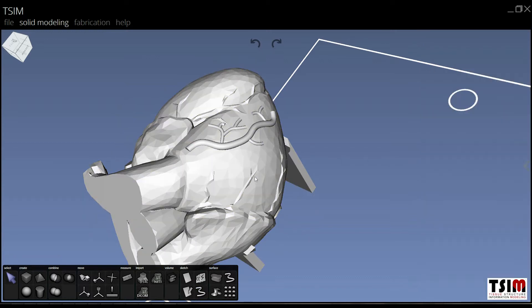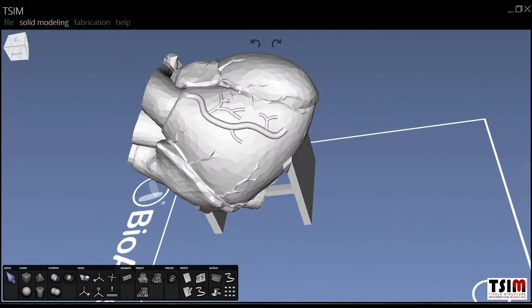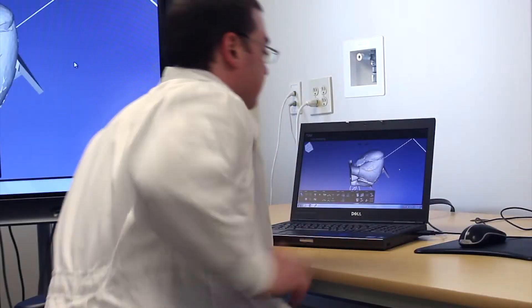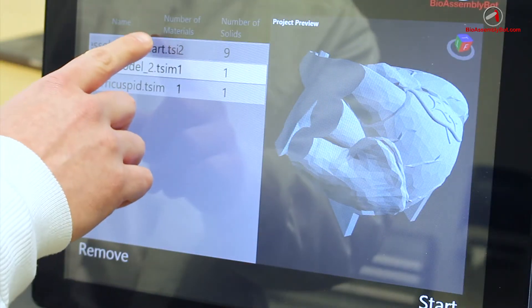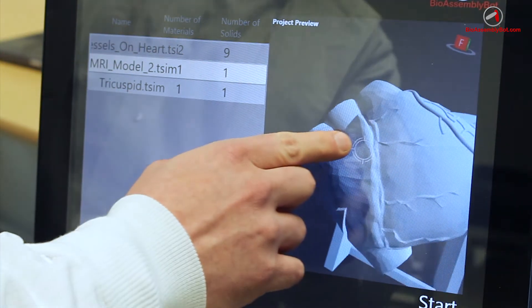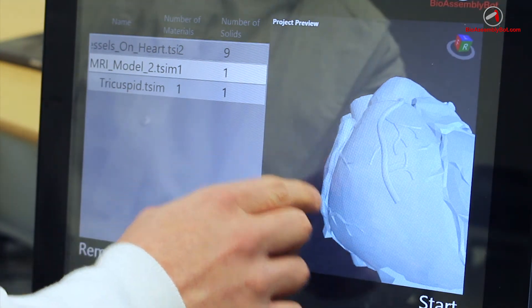Once constructed in TSIM, the model, including the added vascular tree, is then sent over to the BioAssemblyBot and chosen from the menu of possible projects to print.